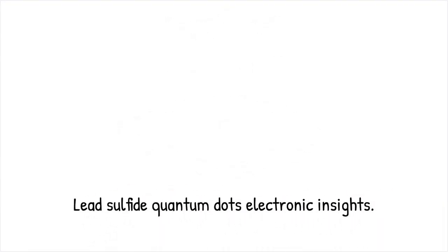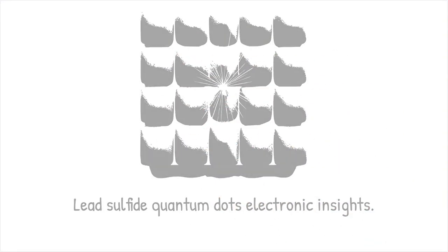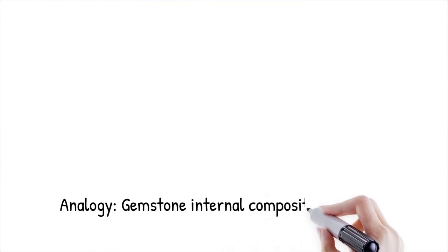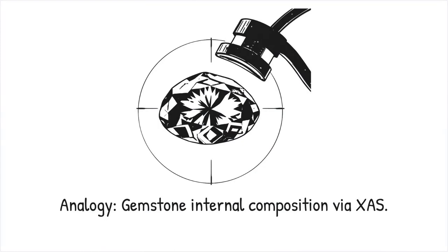For example, XAS studies on lead sulfide quantum dots have provided detailed insights into their electronic hybridization. It's like using an X-ray scanner to analyze the internal composition of a gemstone without cutting it open.